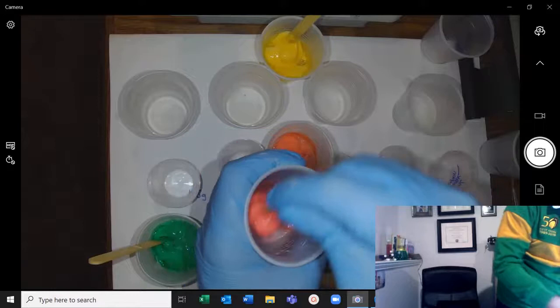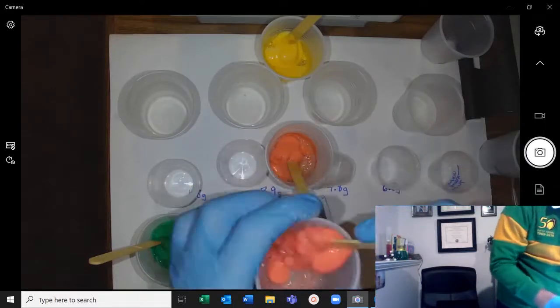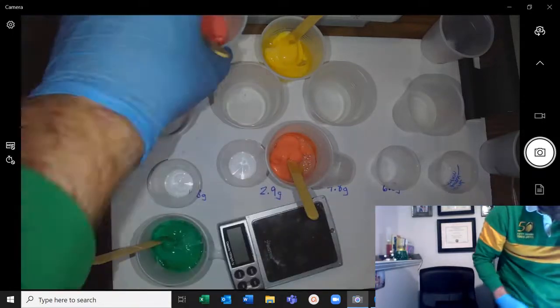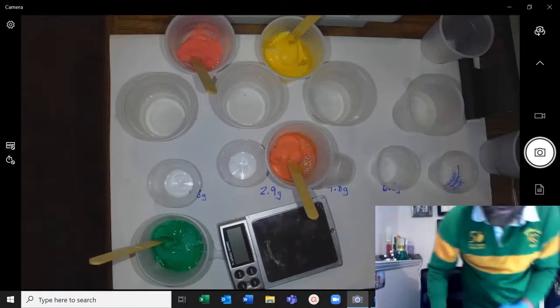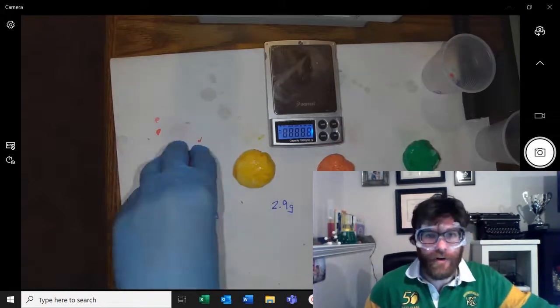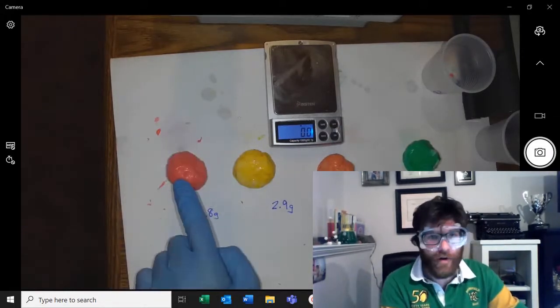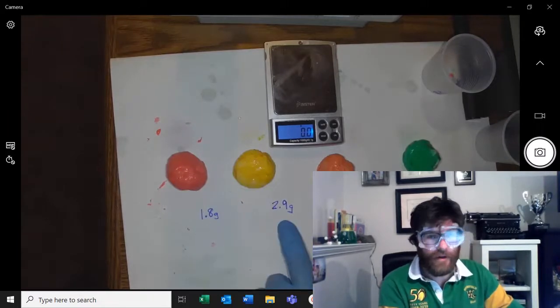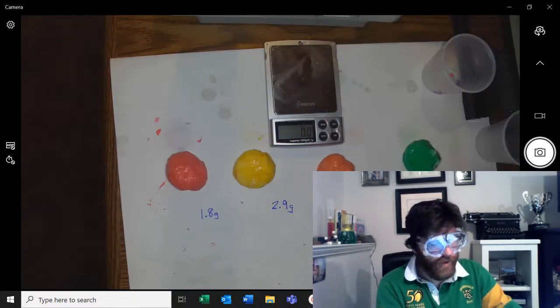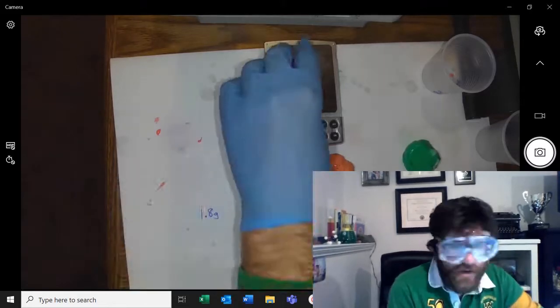And so I'm going to try to make about even sized balls for each of these bouncy balls. We're going to try to get them about the same mass, but we'll see how it turns out. I'm going to knead them into balls and be back in a minute. Alright, so we're at the point where we've got our slime balls. Remember, we had our red ball had 1.8, yellow 2.9, 4.8 grams for our orange, and 6.8 grams for our green of borax. Now we're going to measure the actual mass of the ball.